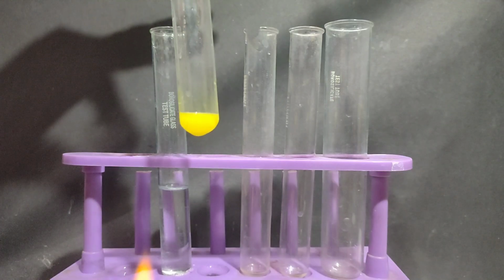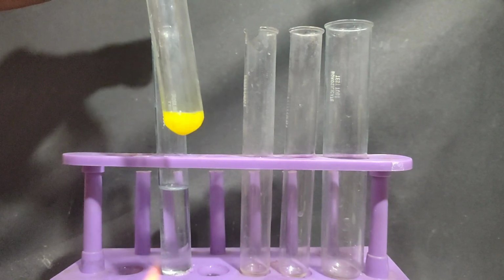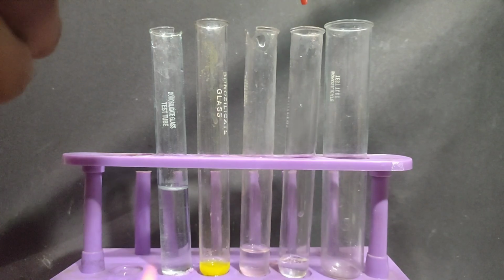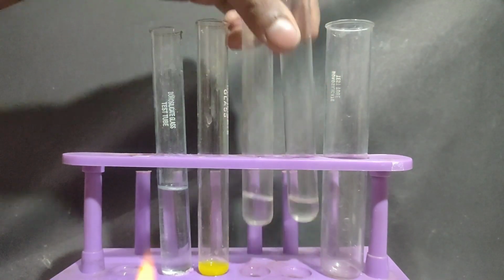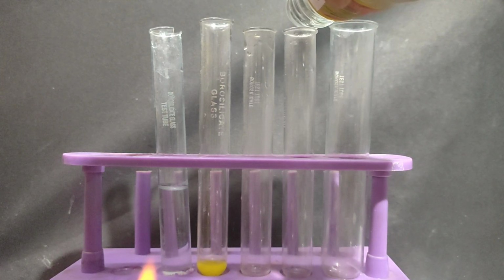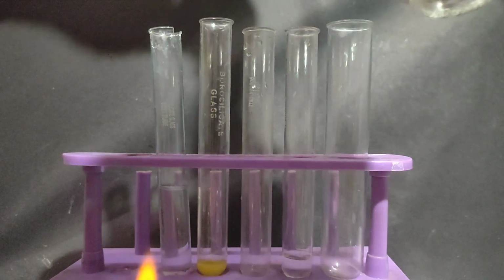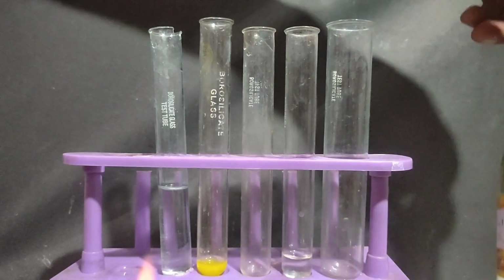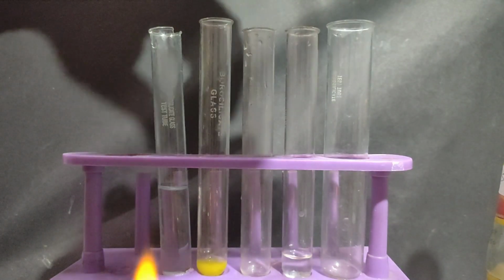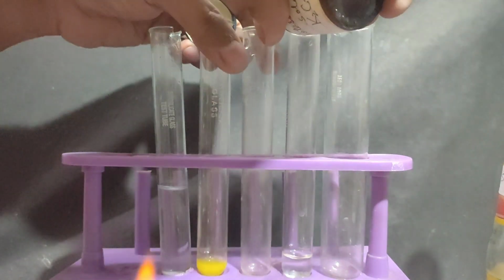You can see this is yellow color. This is the presence of lead iodide. Let me wash these test tubes first. To the third test tube I'll be adding some dilute sulfuric acid. To the second test tube I'll be adding some potassium chromate solution.